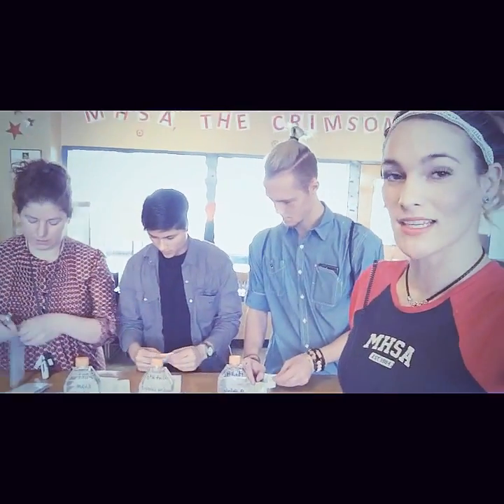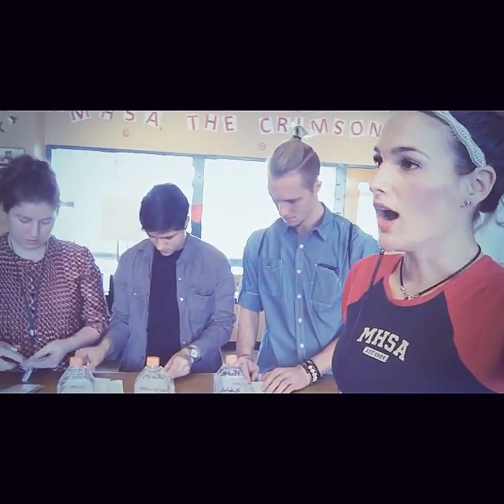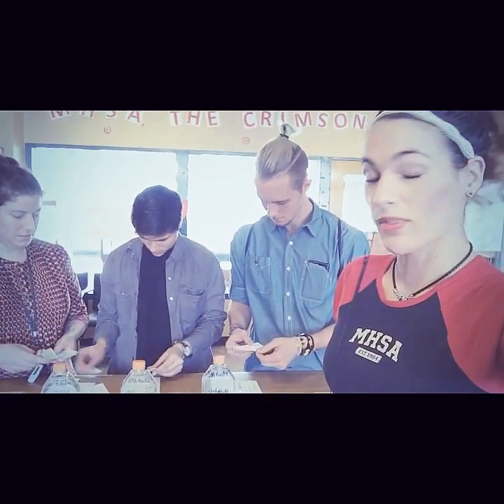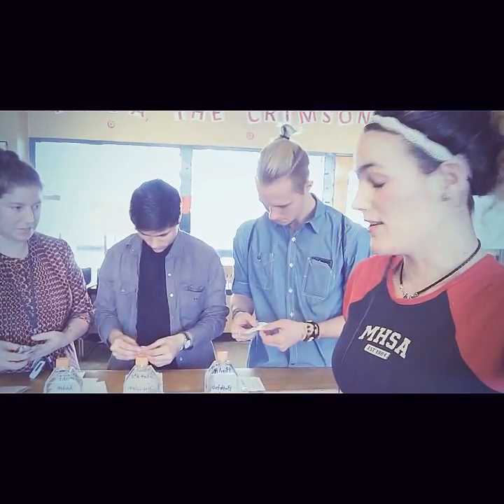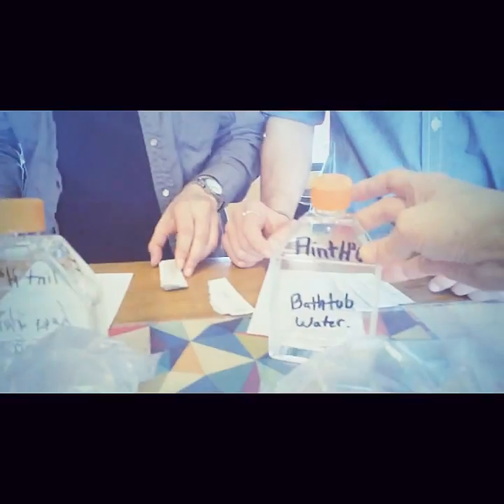So they are going to be conducting their tests to see what the pH levels are, the copper levels are, and we're going to get the results here today on that. But for lead results, we have to actually send those in. So we're gonna see. I'm curious to see what the results are.